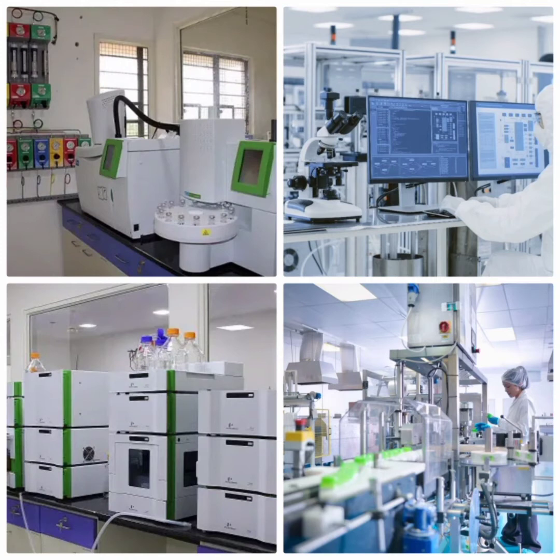A general question that comes to your mind is how HPLC and GC are different from each other and what factors decide the suitability of one over the other.